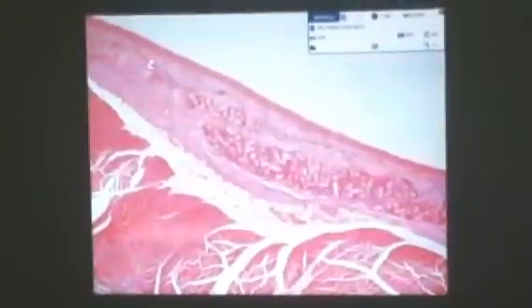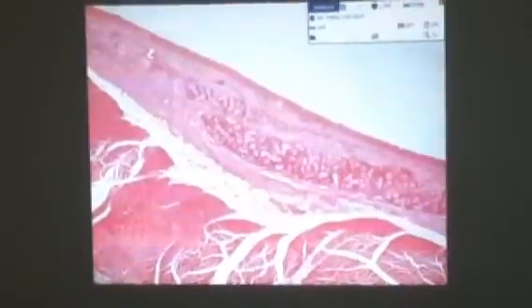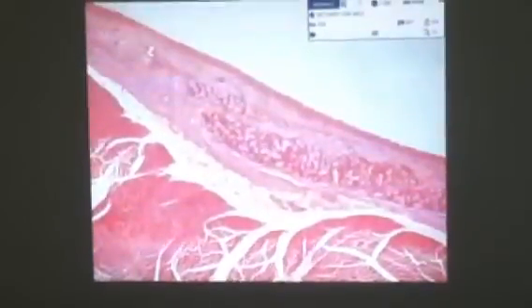What is the specific name of that pointed structure, which is sitting on top of a mucous acinus? Serous? Okay, very good. Serous demilune. So it will show a half moon shape appearance. So seromucous glands in the lamina propria, their secretions will add up to the film of mucus, which is produced by the goblet cells of the epithelium.